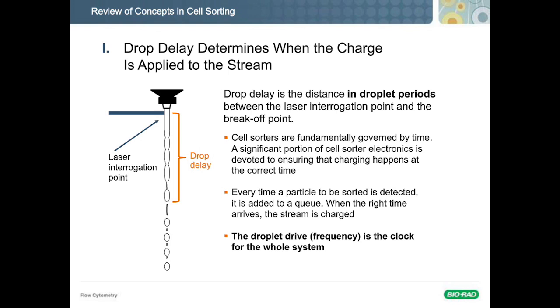That is what is setting the overall timing for the whole system. By driving that piezo crystal in fixed periods, the strobe is based off that, all of the timing is based off of that. And by basing it off of that, it ends up a little bit more resistant to any velocity fluctuations, because everything still ends up directly tied back to that drop drive frequency.